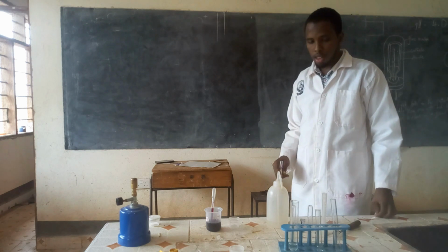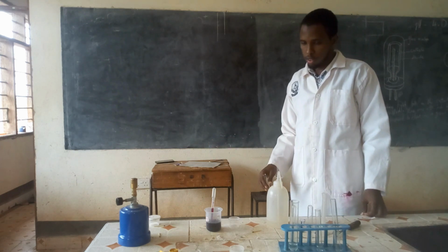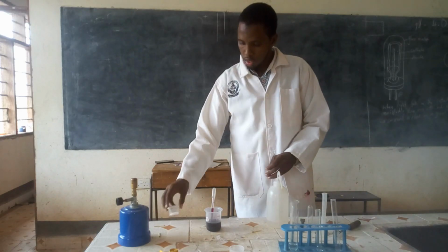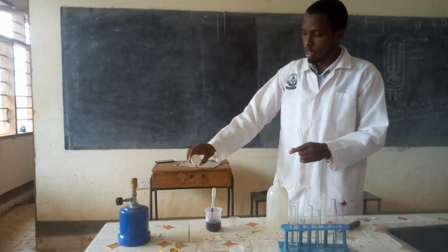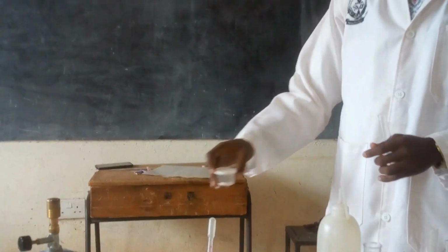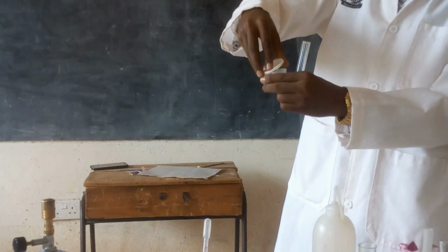Now to the second portion, you add all the sodium hydrogen carbonate provided. So that is sodium hydrogen carbonate. All of it you will add to the second portion.